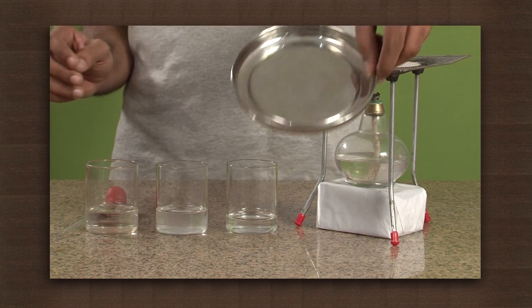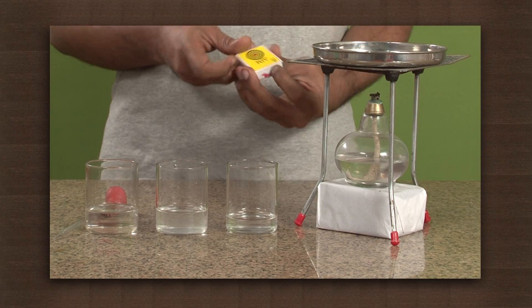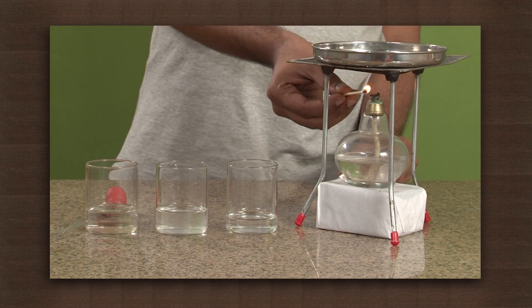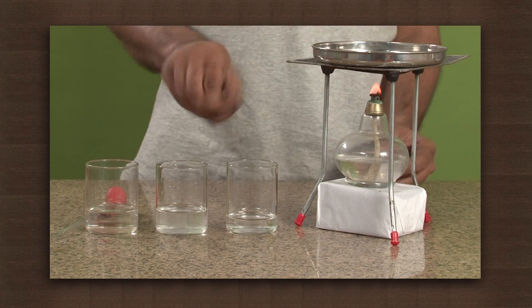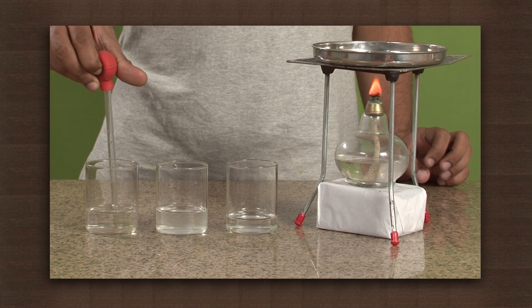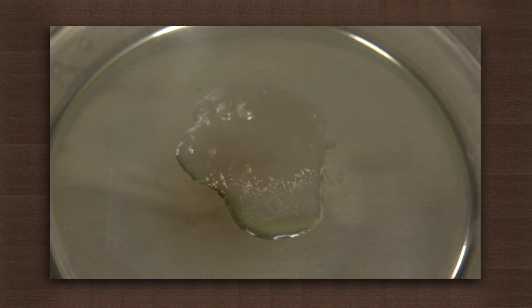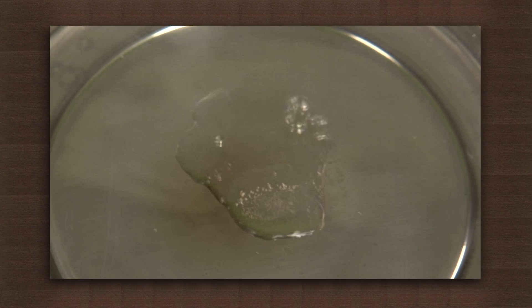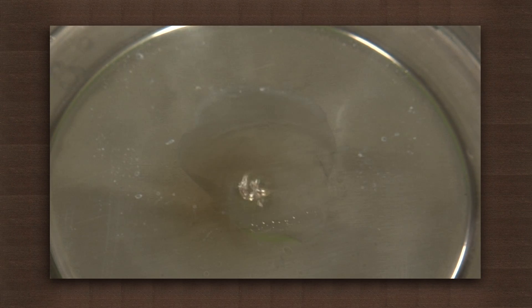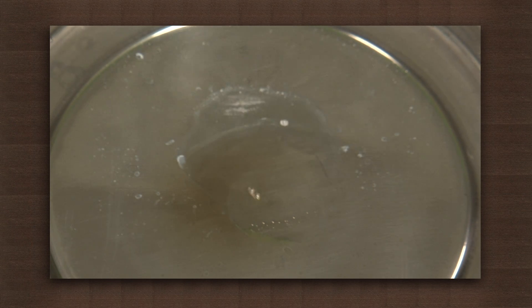We also need a spirit lamp and any metal plate. Light the spirit lamp, take a few drops of hard water in the plate, and heat it till the water evaporates. The salt remains behind in the form of a residue. Observe the quantity of residue that remains behind.